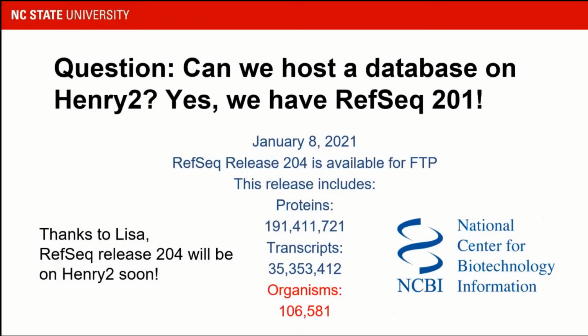What about local? Can we host a database on Henry 2? Yes, Lisa helped me get RefSeq 201 on Henry 2. Lisa is going to help me update it to version 204 soon enough, which has about 3,000 more organisms than our current version. In total, it contains 106,581 organisms. It's a lot of genomes.